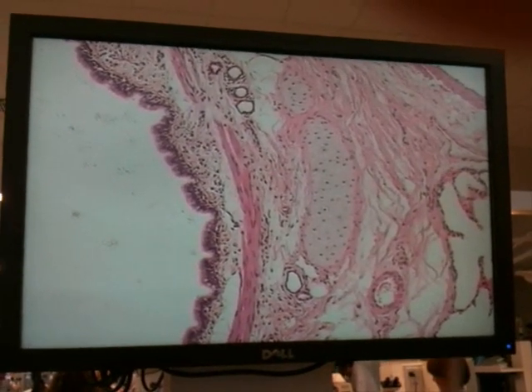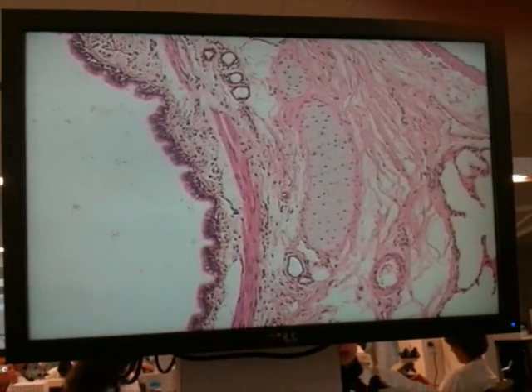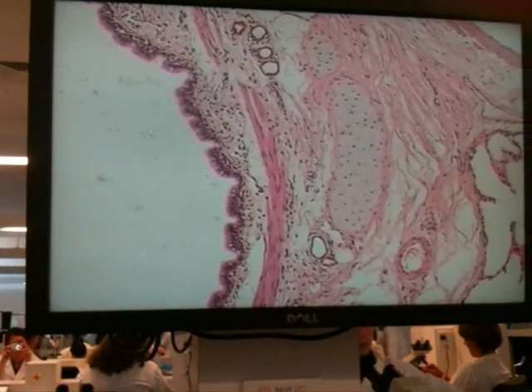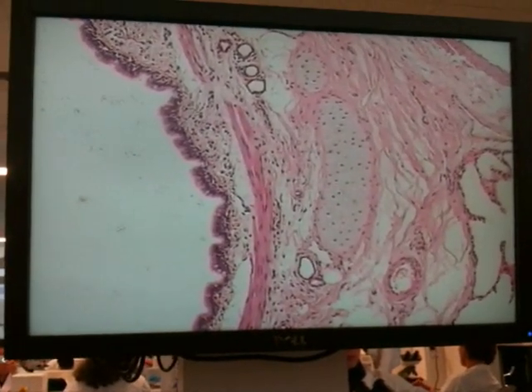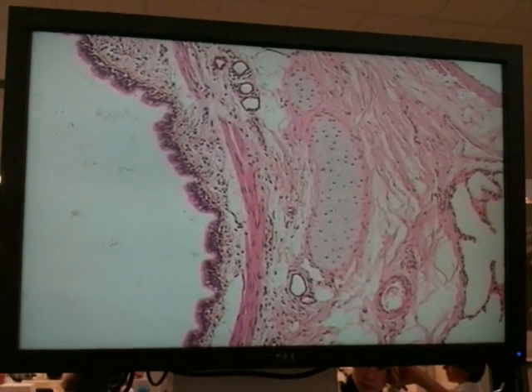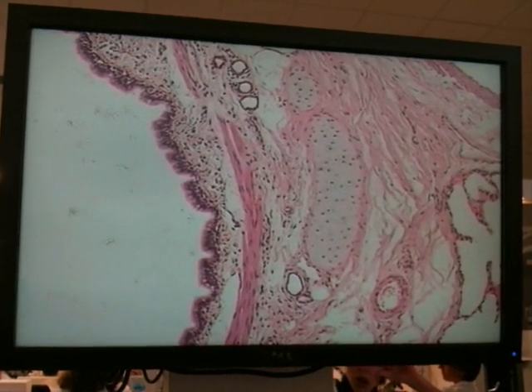Up at the level of the principal bronchi, which would be much bigger than this one, that muscle is still in the same sort of circular arrangement as we have here. But as we go further down the bronchial tree, it becomes increasingly spiral. It effectively controls the diameter of the bronchus.